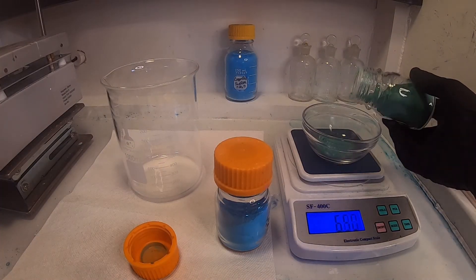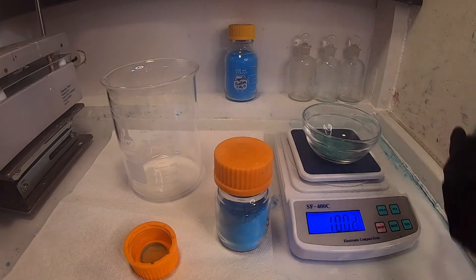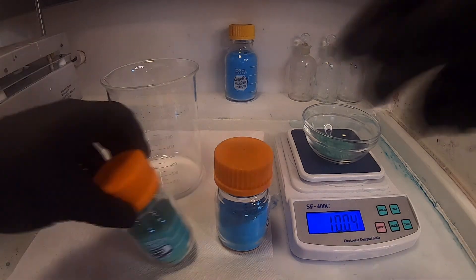Copper acetate is created by mixing either copper hydroxide or basic copper carbonate with acetic acid.